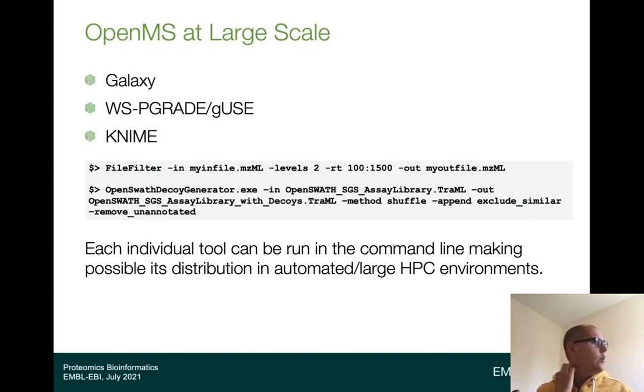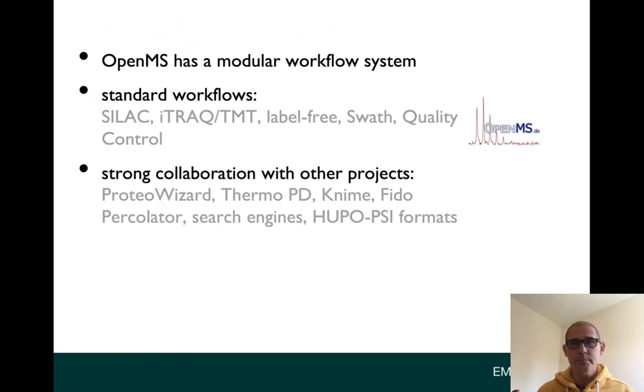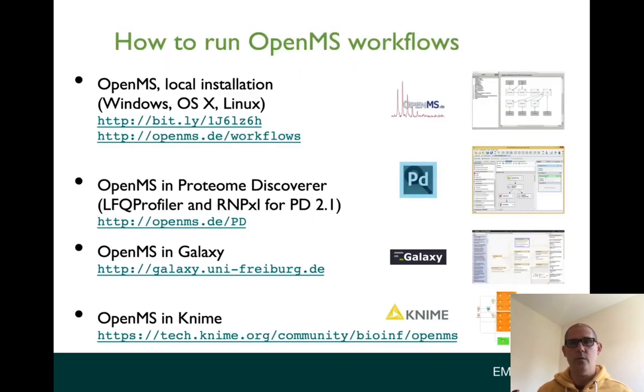And I think the best way to use OpenMS tools is to combine them into pipelines. A pipeline or workflow is basically a piece of software that allows you to run your data analysis in the command line, in a cluster, in a cloud environment, rather than in the desktop application. As I said, OpenMS is a modular workflow system and supports SILAC, iTRAQ, TMT, label-free, and so on, and has a strong collaboration with search engines, HUPO-PSI, Percolator, and so on. These are the links to get information around OpenMS.